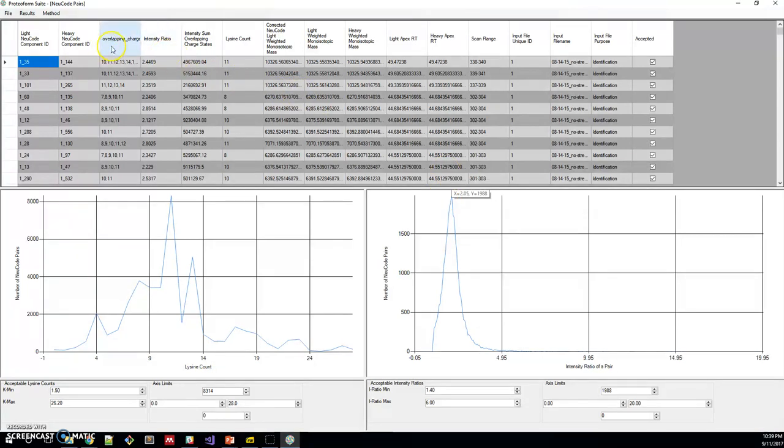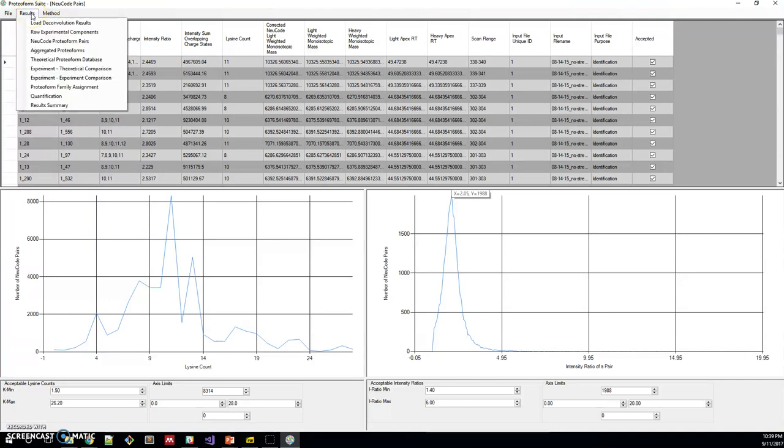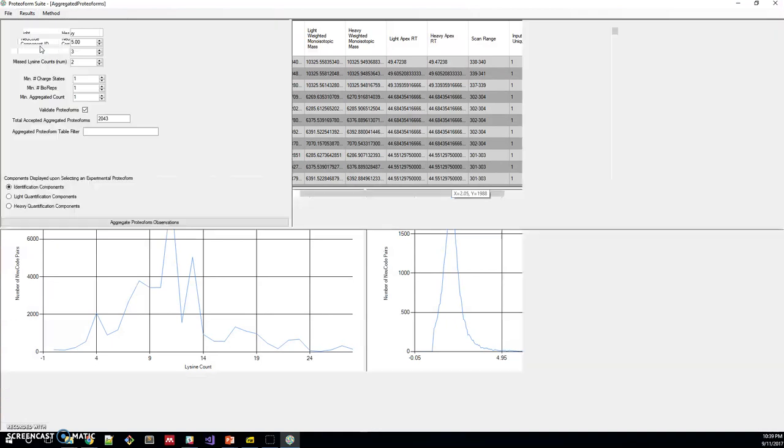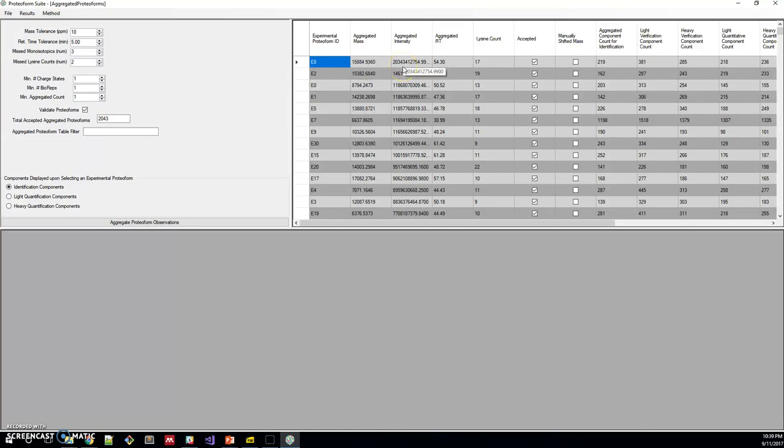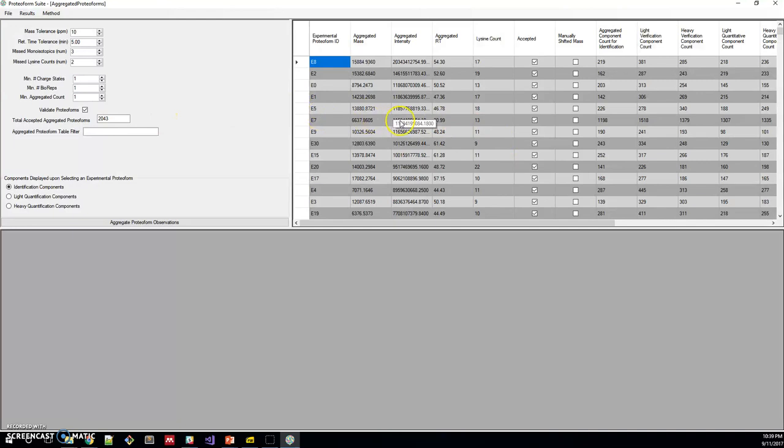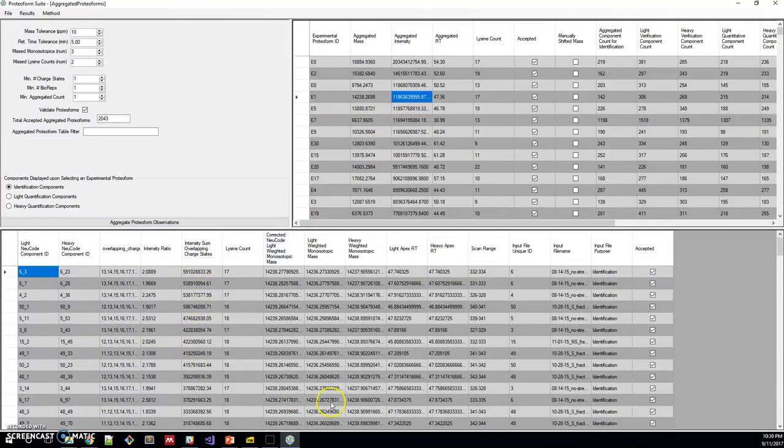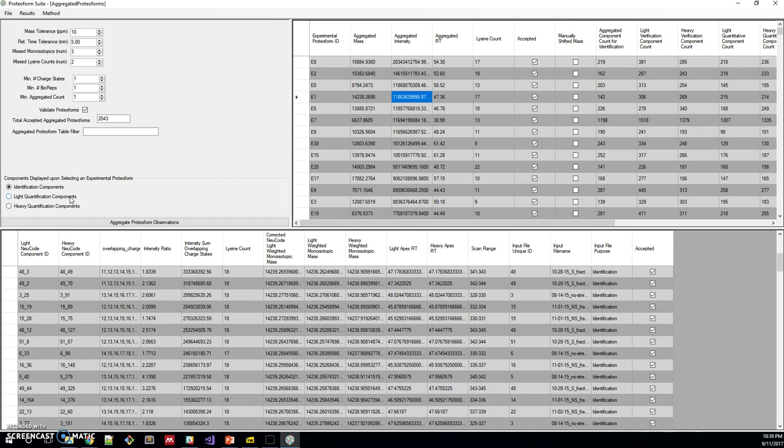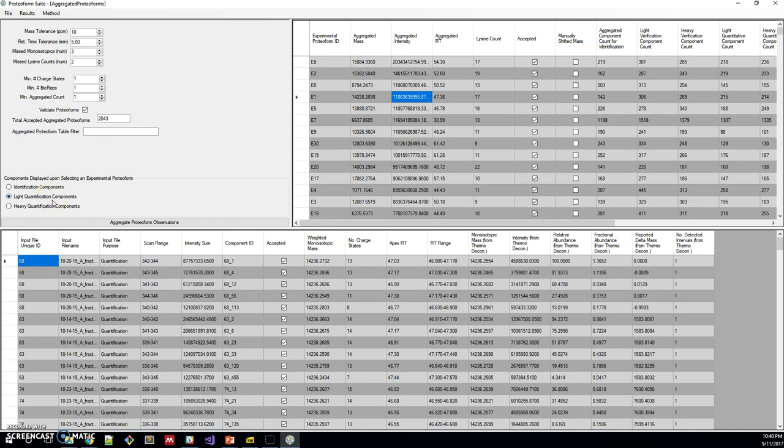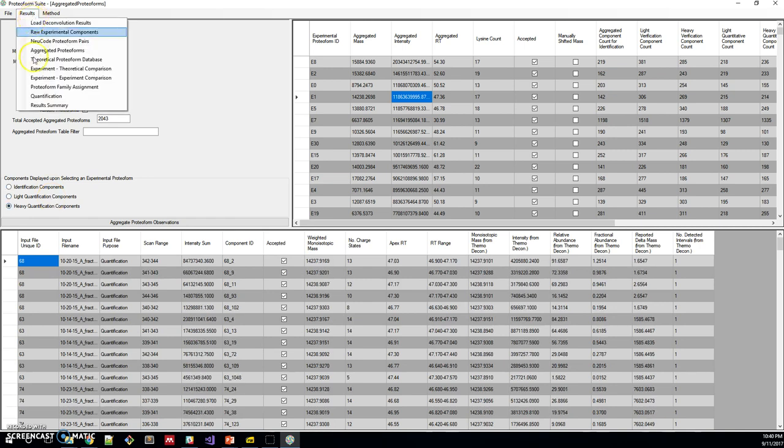Once we've done that, we aggregate these observations, because these are effectively proteoform observations. We aggregate these into what we predict to be unique entities. In this case, we're calling them experimental proteoforms or aggregated proteoforms in some places in this software. This is the list of experimental proteoforms. There are 2,000 of them or so. When we click on one of them, we can see all of the components that went into that experimental proteoform identification. On the left here, we can choose what type of component to display for that experimental proteoform. We can choose to display the ones that went into identification or the ones from the quantification experiment, either light or heavy.